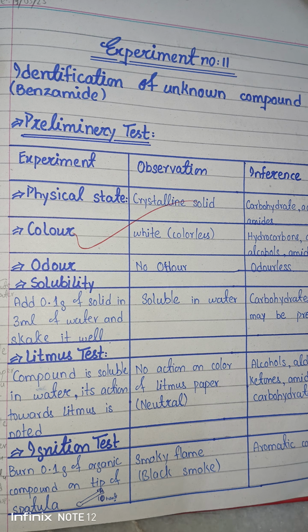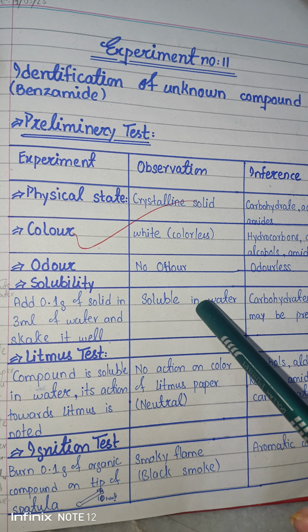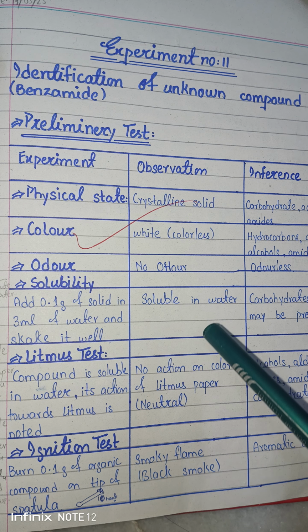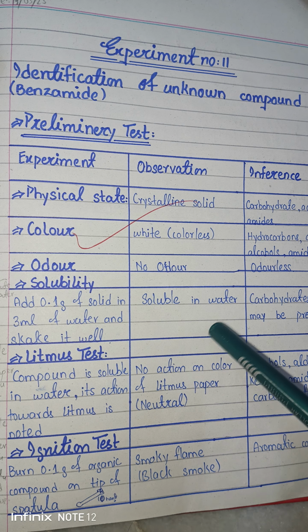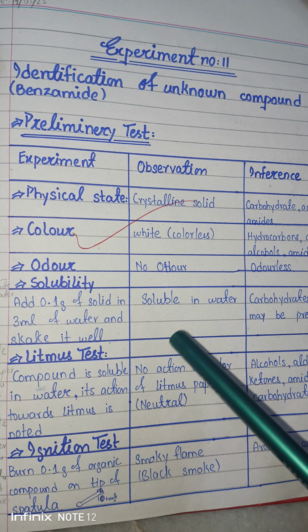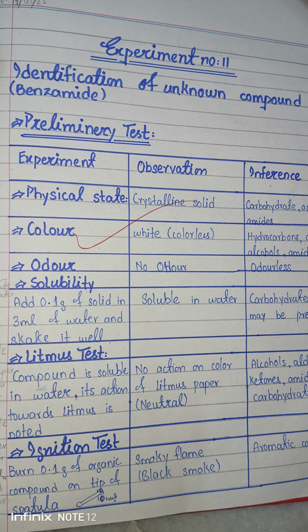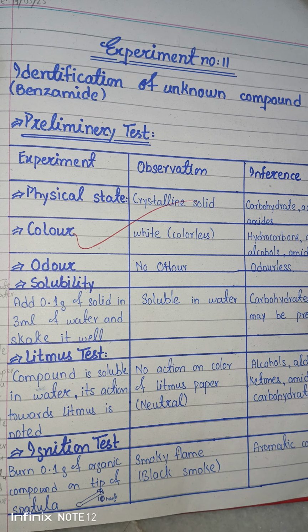While in the case of benzoic acid, we say that benzoic acid is insoluble in cold water, but it is soluble in hot water. And benzoic acid is also soluble in NaOH and ether. So we say that some aromatic acid may be present. But here, this benzamide is soluble in water, whether it is cold or hot. This is not an option, but it is soluble. Therefore, carbohydrates, acids, phenols could be present.